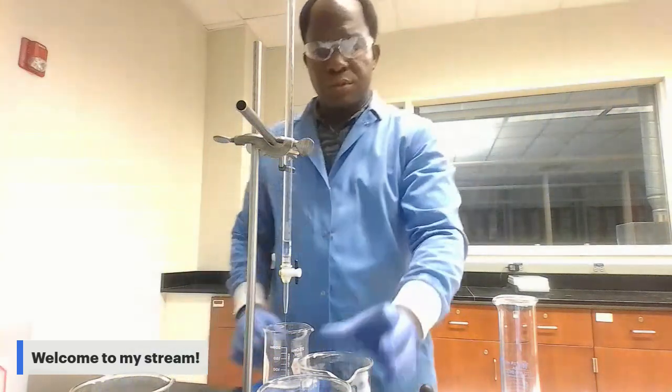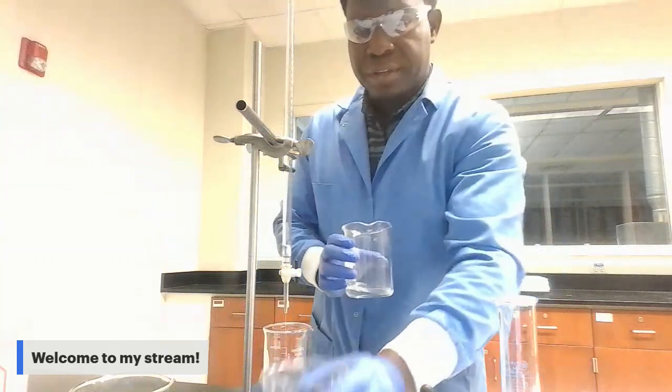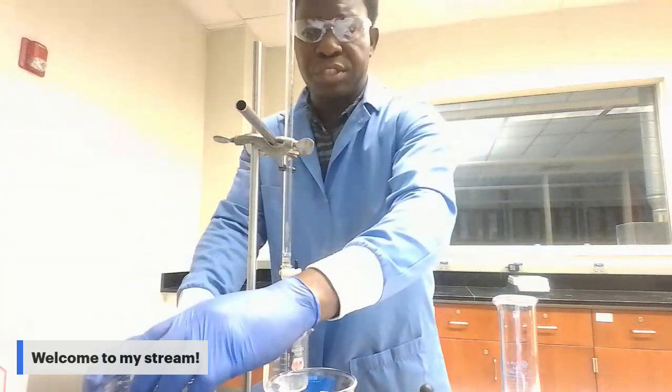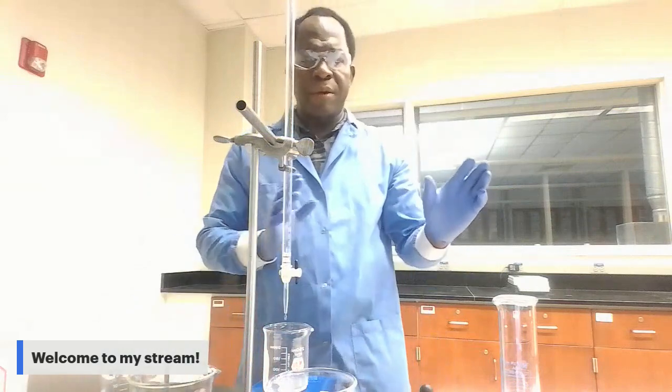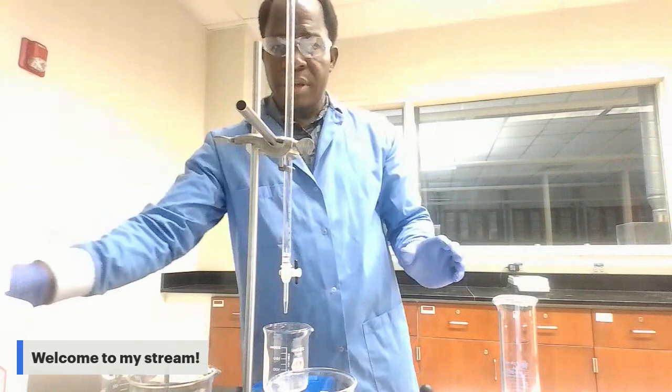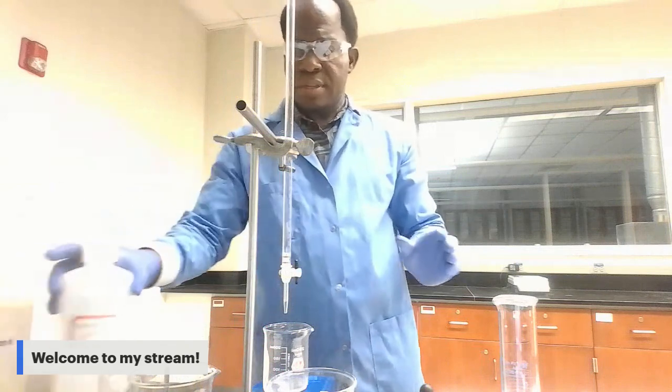You do the same thing for the three solutions. You dump them in the liquid waste, and you clean up your desk.